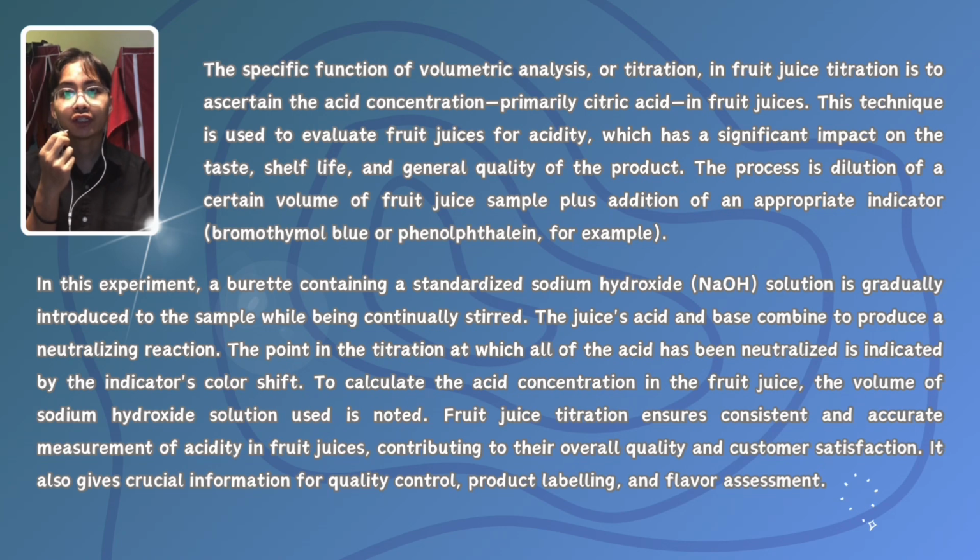Fruit juice titration ensures consistent and accurate measurement of acidity in fruit juices, contributing to their overall quality and customer satisfaction. It also gives crucial information for quality control, product labeling, and also flavor assessment.